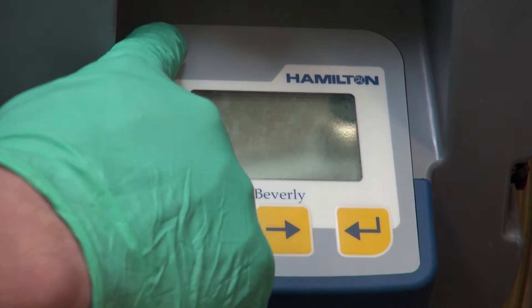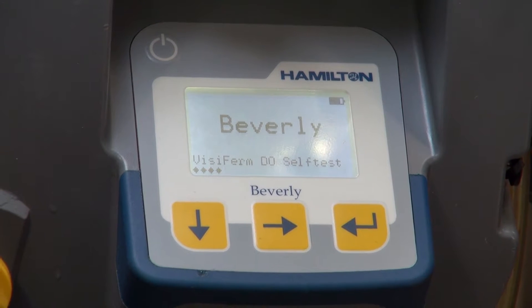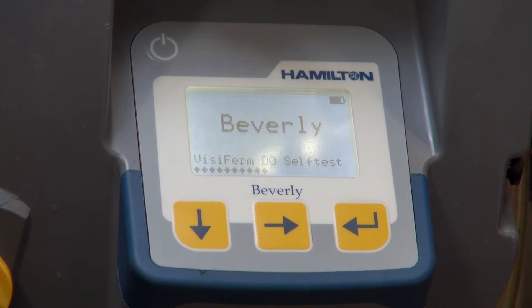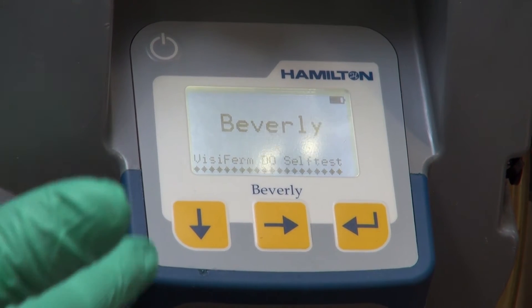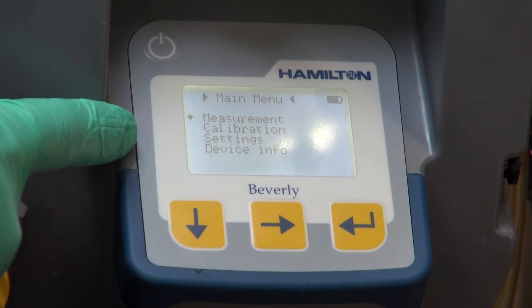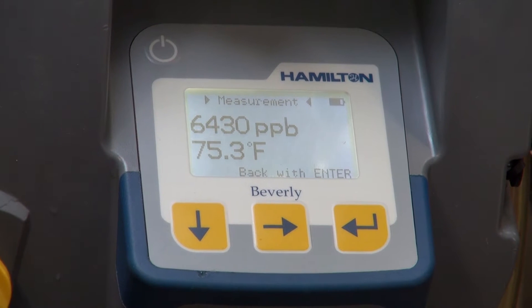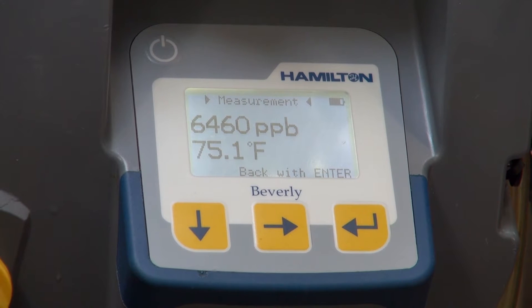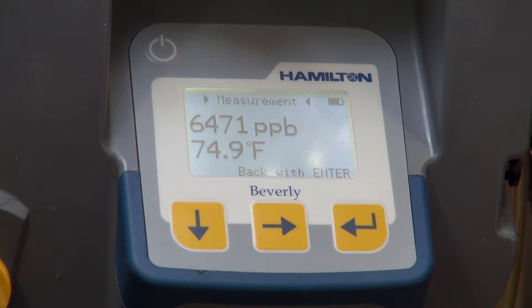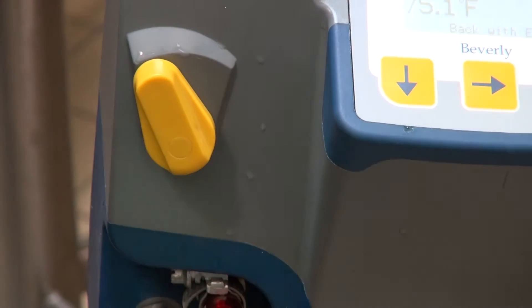Once connected, simply turn on the Beverly unit — startup is pretty quick. Once we open up to the main screen, it's very easy to choose from measurement, calibration, and settings. We'll go to measurement. Right now we're in the parts per billion measurement section, which is great for testing beer from bright beer tanks, the packaging hall, or immediately during a transfer. Notice the valve — simply close or open it to start the flow into the meter.